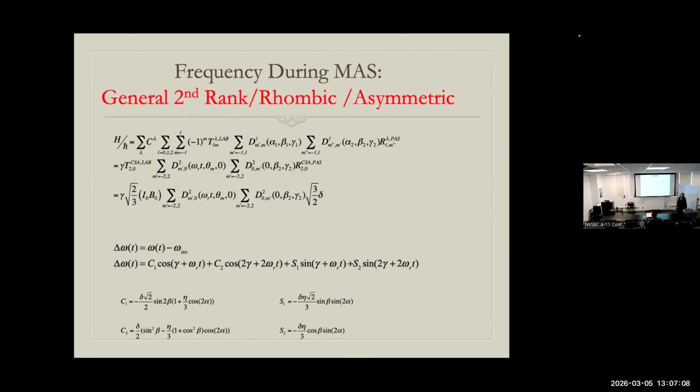It's very likely that if you have a few thousand, you will cover. Why? Because the line width can be imposed on each crystallite, and it could be of the order of a 10th of a ppm to 1 ppm. Our line widths aren't as good as solutions sometimes. So you wouldn't find the 1 ppm line width necessarily, but sometimes we're good with that.